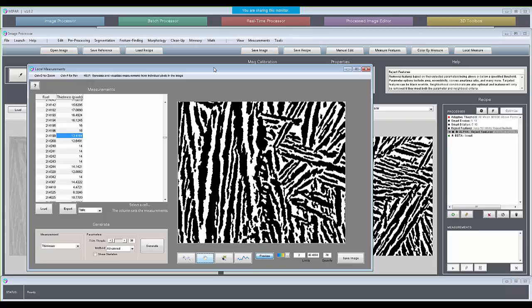that you can make unbiased measurements of things like area fraction and size, which is why we almost always acquire multiple images per microstructure. So there's plenty of work out there and plenty of studies that you can do, that we have done for different cases, for different measurements of interest.